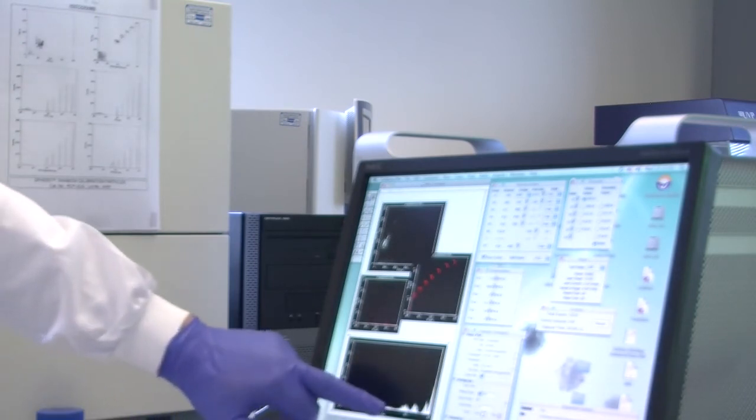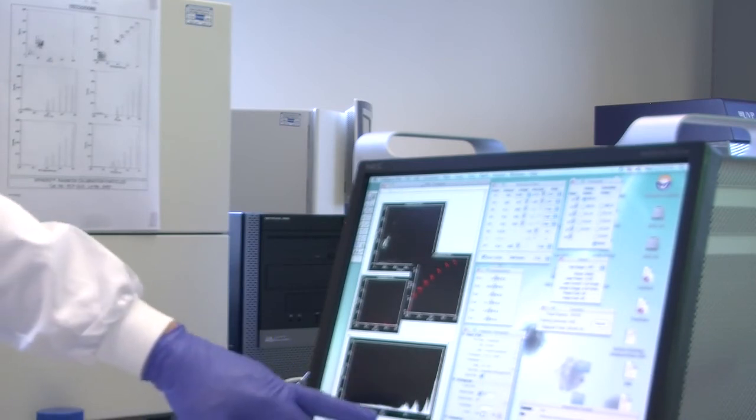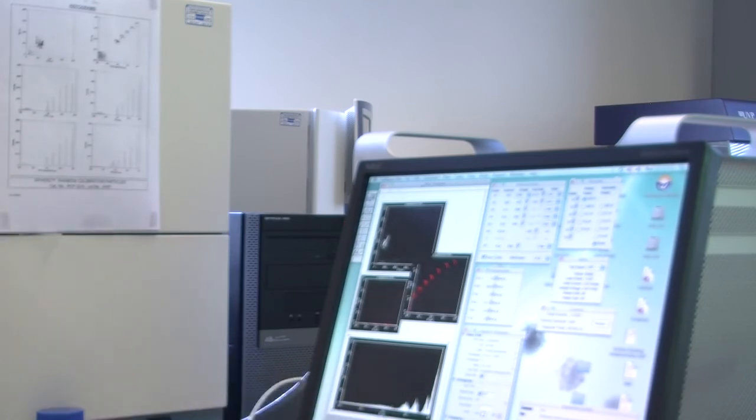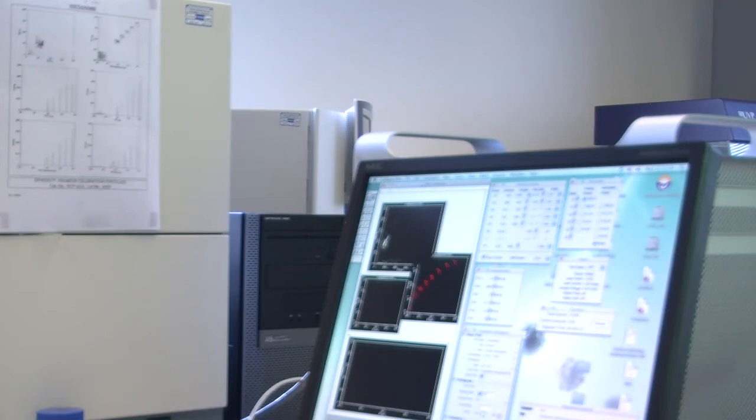Now these beads are pretty much non-fluorescent, near enough, but they're showing as 10 to the 2. If I put this detector setting down to 150 minimum, and I pause and restart, I don't think we'll see anything at all. We're seeing some stuff on the edge, and that's it. That would say they're non-fluorescent. So we don't have an absolute measurement. The machine will not tell you, yes, they are fluorescent, or no, they are not. What it will do is tell you, yes, they are fluorescent compared to.